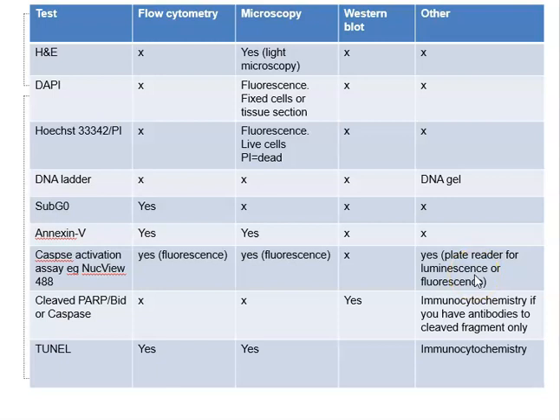Okay, so that summarises all of the likely assays, and you will cover some more as we go through the module, and especially when you do specialist flow cytometry lectures maybe in semester 2. So the sort of question that I could ask you on the exam is, here is an experimental situation, propose the most appropriate apoptotic assays that would distinguish between apoptotic, normal and necrotic cells. And that's a sort of question that I may ask you to answer. Okay, so that's the end of this session.